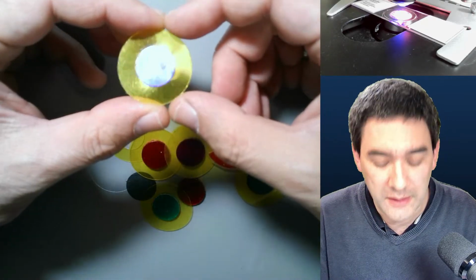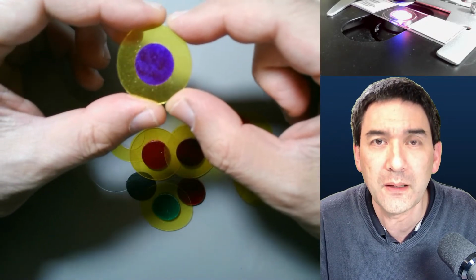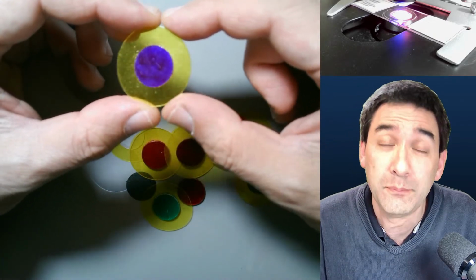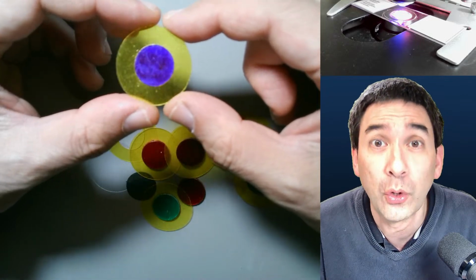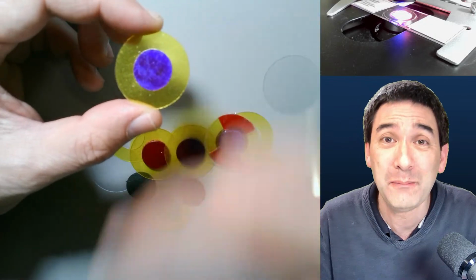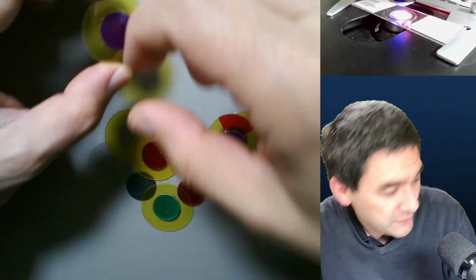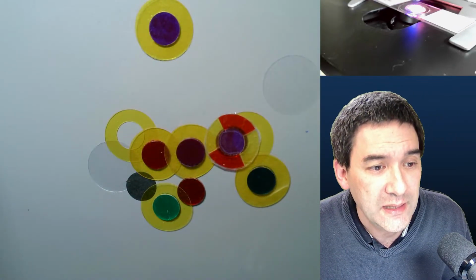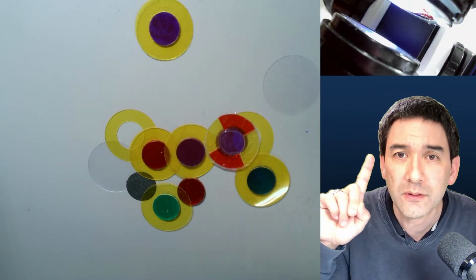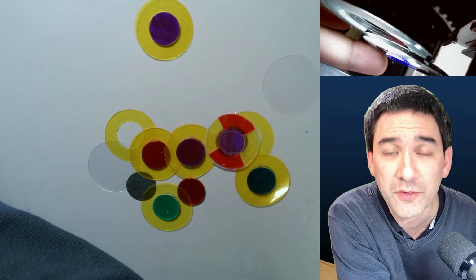What happens is the following: you put this filter into the filter holder of the condenser. This only works if your microscope has a condenser, and pretty much all microscopes with a condenser also have a filter holder. Sometimes this filter holder might not be easily visible because it's a swing-out one, and you have to search, and then all of a sudden you discover that it swings out. I don't even know if I'm able to show this to you. You can check at the top. I'm going to show you. Now it's the bottom of the microscope here.